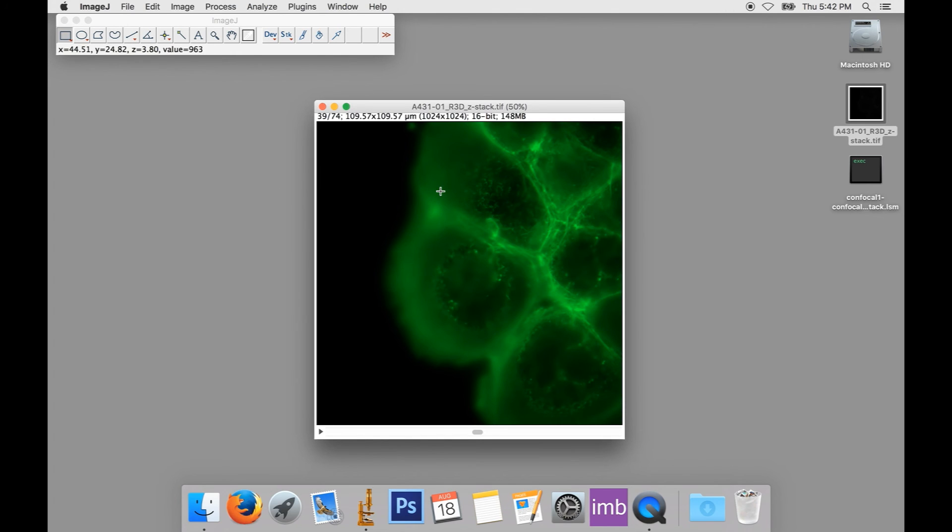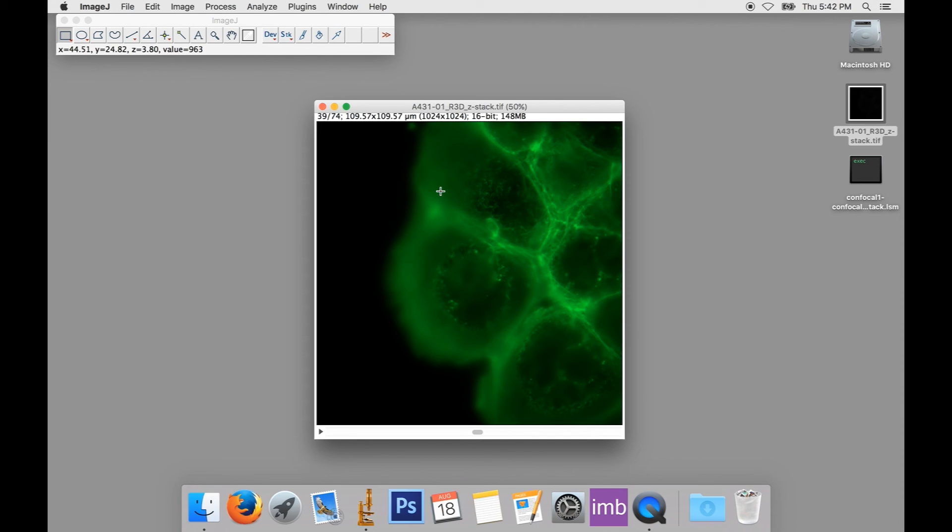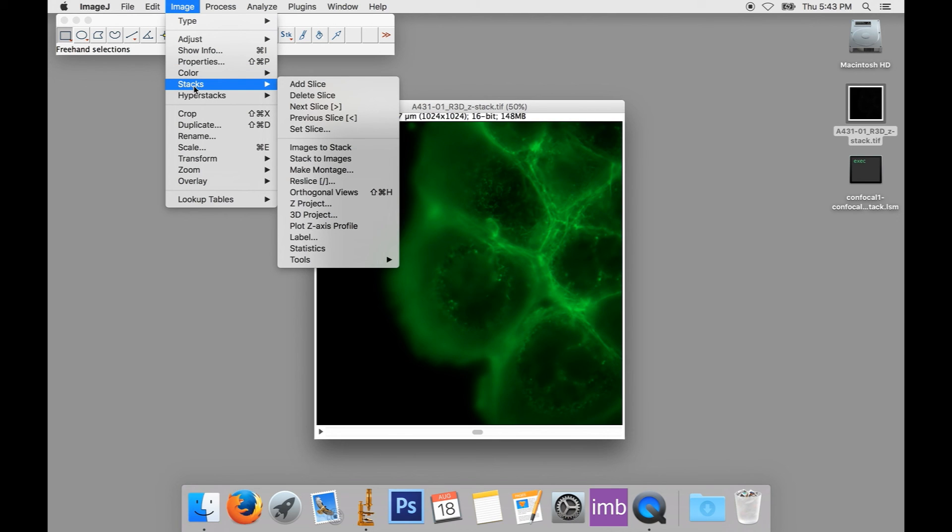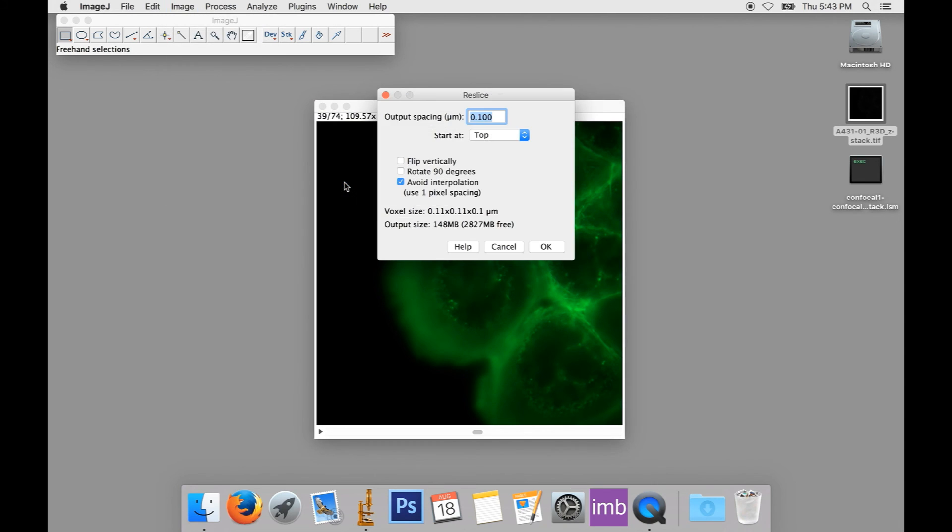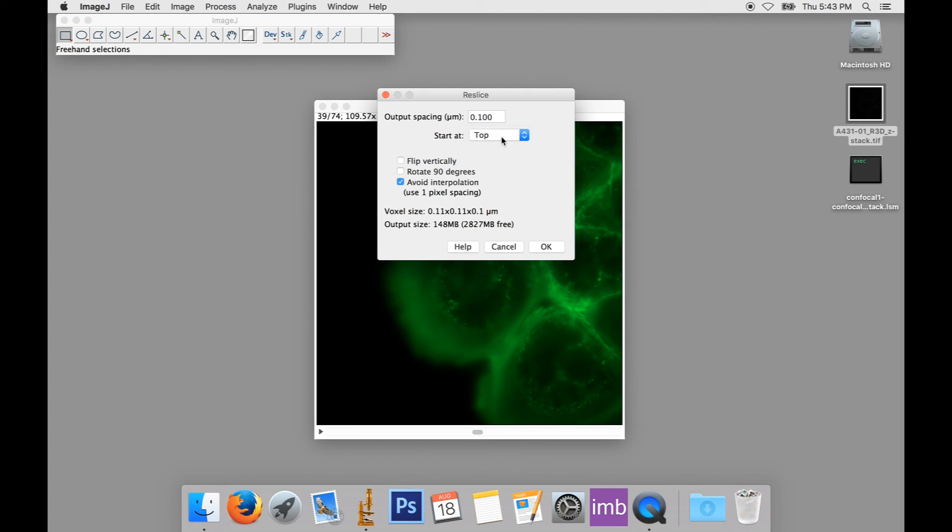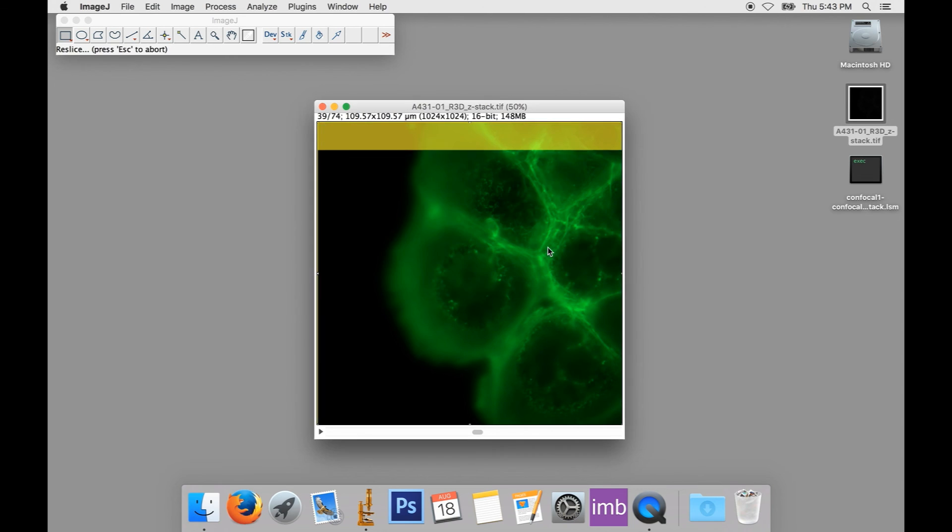And if I close these two windows, we lose our orthogonal views, but we can look at another tool as well called the Reslice tool. The Reslice tool works in a similar way, but will change the view of our data to be along the X or Y axis instead of along the Z axis. This tool can be found again under the menu, Image and Stacks, and then we go to Reslice. Now we'll have to tell it where we want to start. So we can start at the top, bottom, left or right. Usually we'll start at the top or the left. And usually I tell it to avoid interpolation. If we click OK, you can see it goes to work.